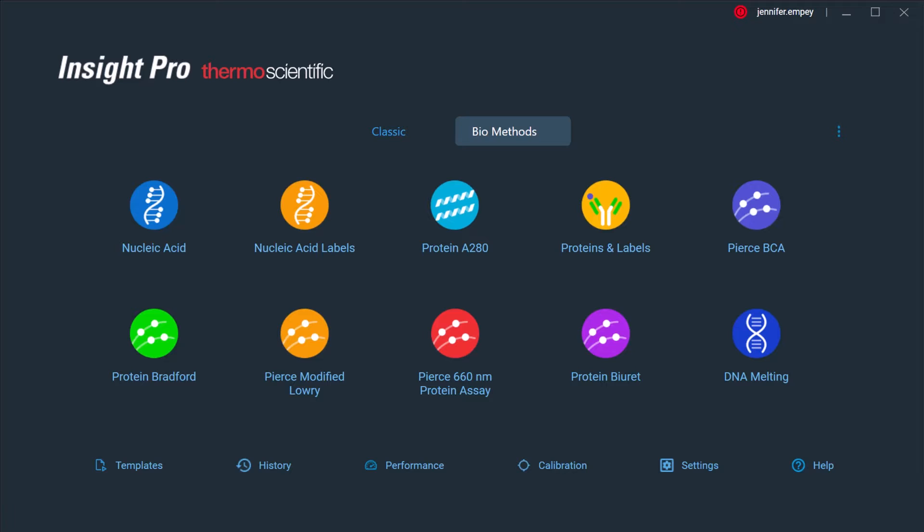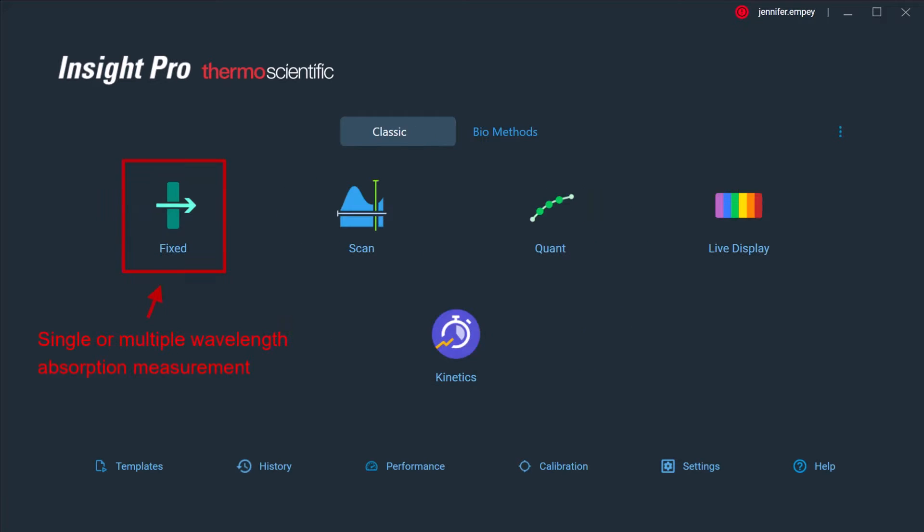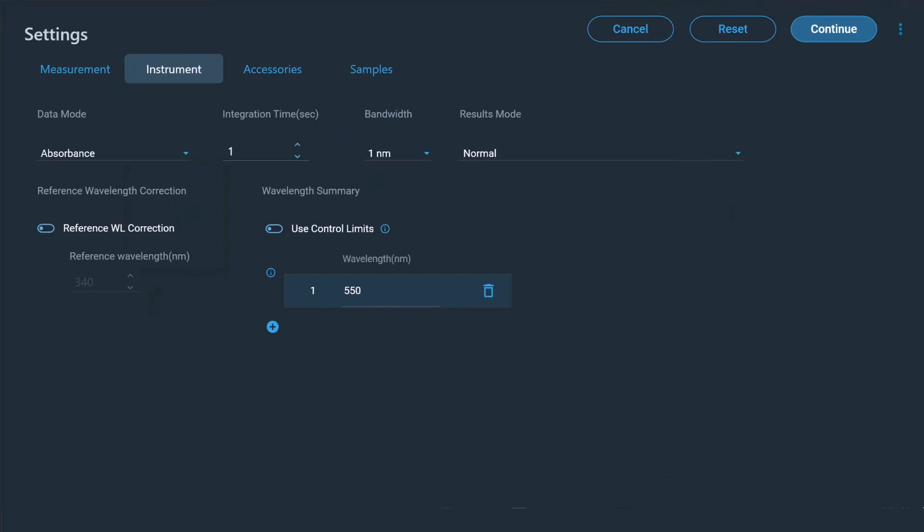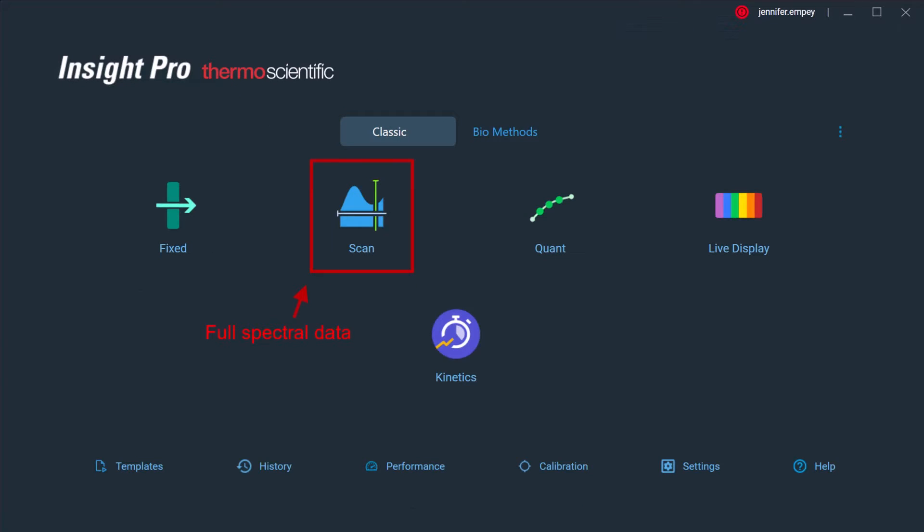The Fixed application is used to select one or multiple wavelengths at which the absorbance or percent reflectance of the sample can be collected. The software enables users to choose the wavelengths of interest and integration time. When Insight Pro is used with the Evolution Plus or One Plus, bandwidth can also be adjusted.